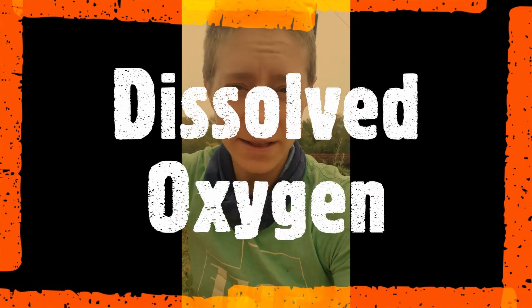Okay, so let's talk about our next test here, which is dissolved oxygen. So there's a delicate balance that goes on with oxygen in the environment. You have animals that breathe oxygen, taking in oxygen and releasing carbon dioxide, and then the plants take in the carbon dioxide and release oxygen. So anything that upsets this delicate balance can be really devastating to the whole ecosystem. So let's take a look at what the dissolved oxygen is like in our two different samples.